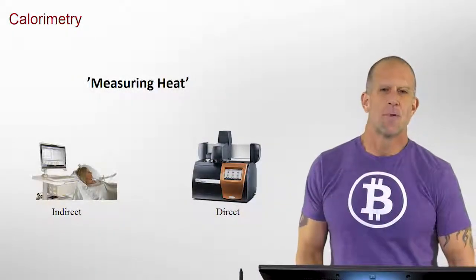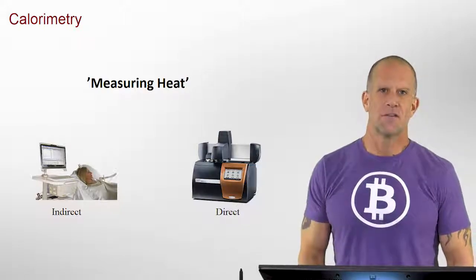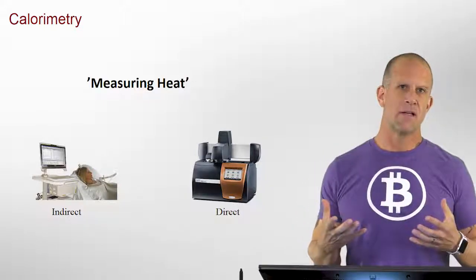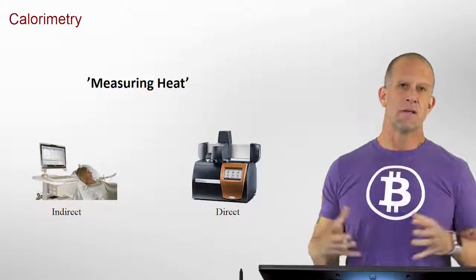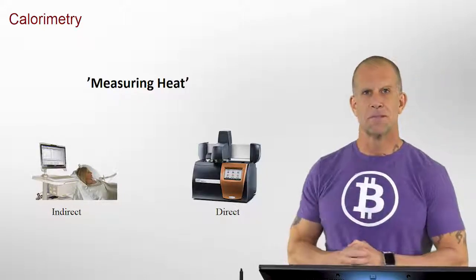I'm Jeff Yarger. I'm a professor of chemistry, biochemistry, and physics at Arizona State University in the School of Molecular Sciences. I'm here today to introduce calorimetry and some of the primary calorimetric techniques we use in measuring thermodynamics, with an emphasis on biological systems.